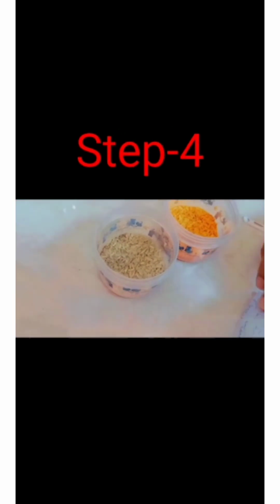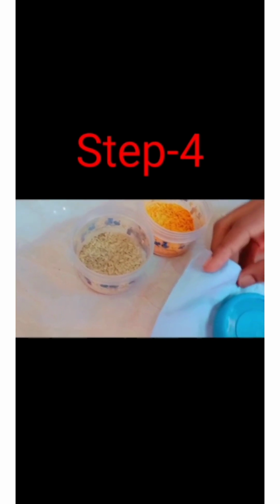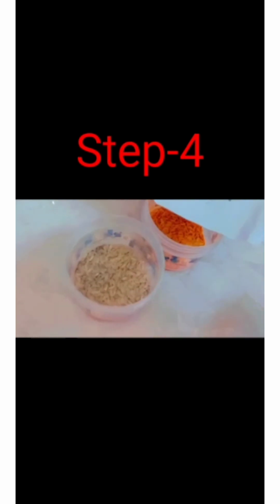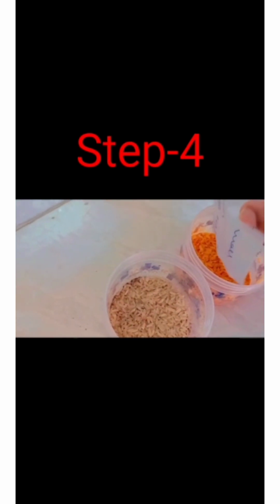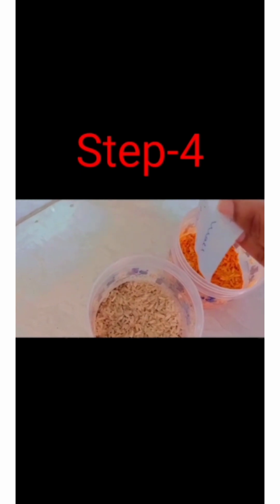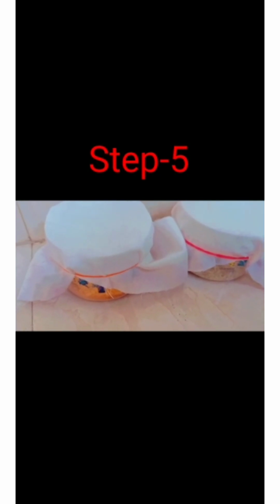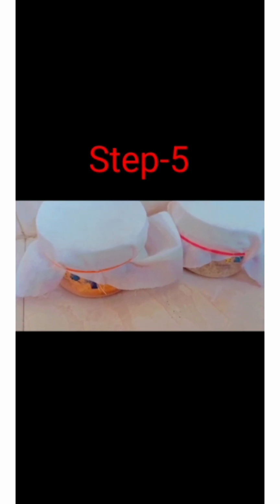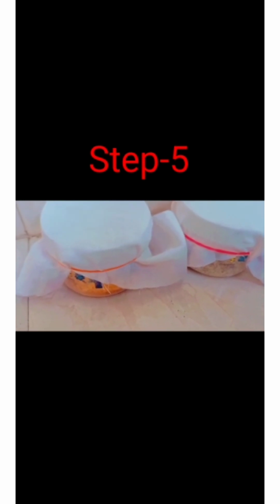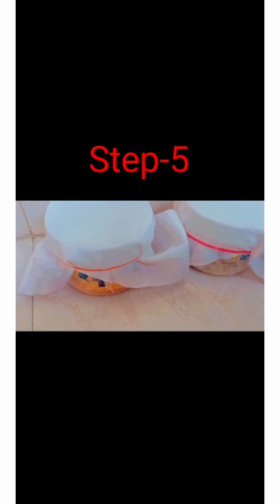After the addition of the 2 organic powders, now I am going to transfer 10 Sitophilus oryzae rice weevils to each of the prepared setups. Now, after the addition of the rice weevils, I have covered the containers with a piece of cotton cloth so that the rice weevils can respire easily.